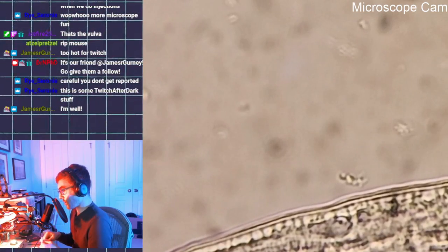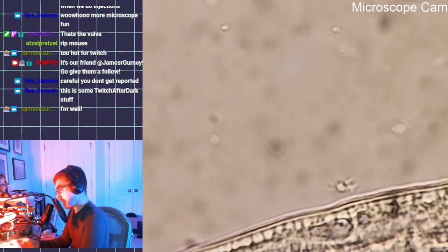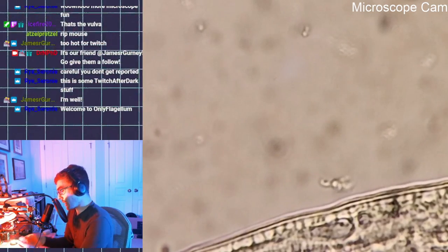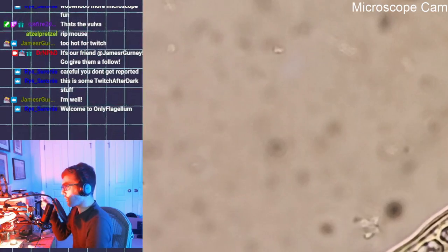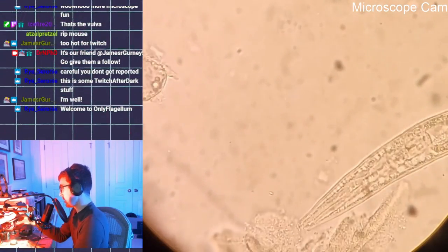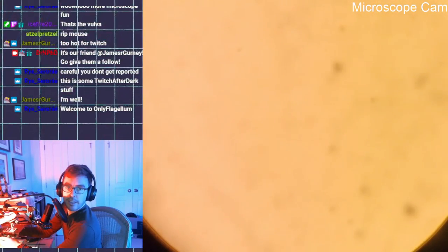I think I'm going to try back. I'm going to look through my plates. Not dumpies. I'm going to find a nice and populated wild type-ish strain. I don't want anyone sterile. That's a good one, I think. Got two that look well populated. So we'll leave these dumpies alone. They were my tests.